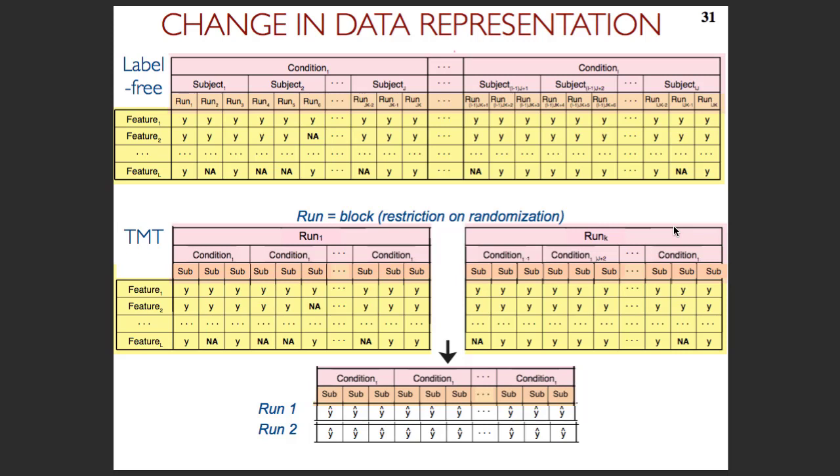So actually, I have another question. From Protein Discoverer, they have a way to set this up. I don't know how, but I think Ting will be able to show you and have some discussion of how to work with Proteome Discoverer for that. But let me maybe also put something else out there.